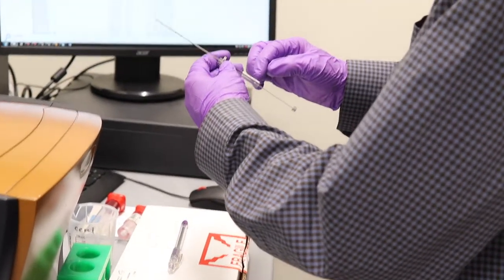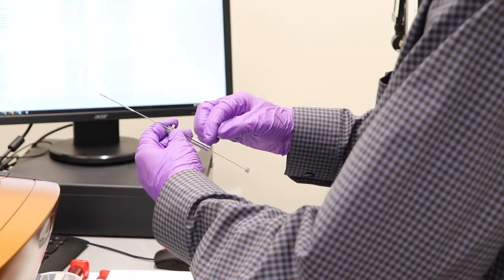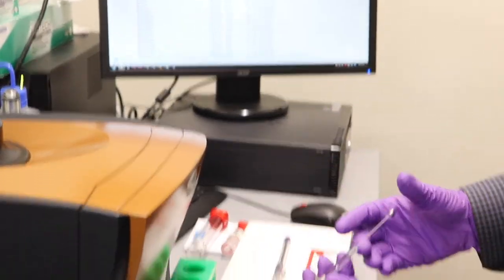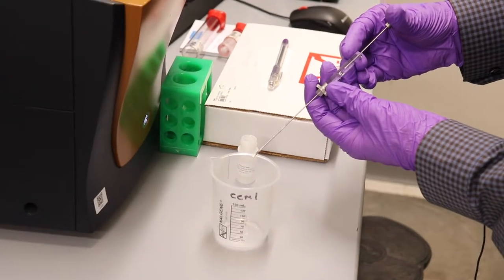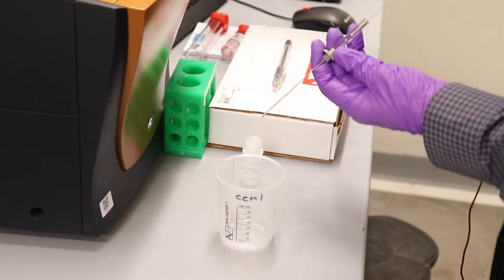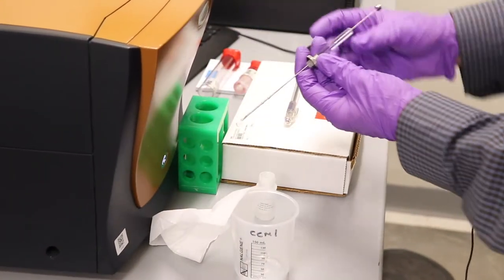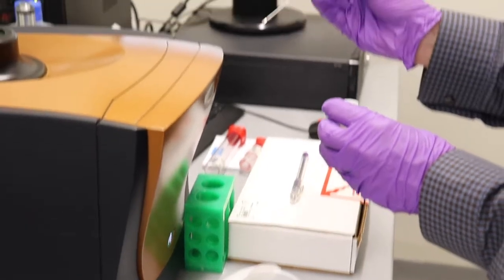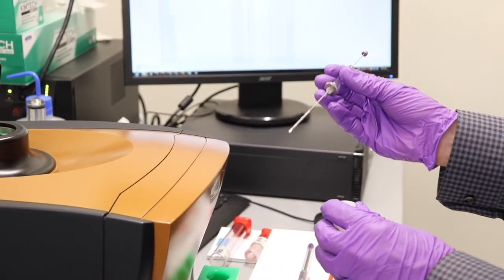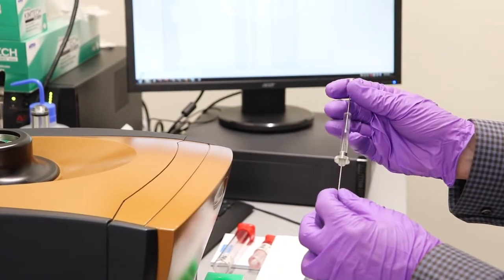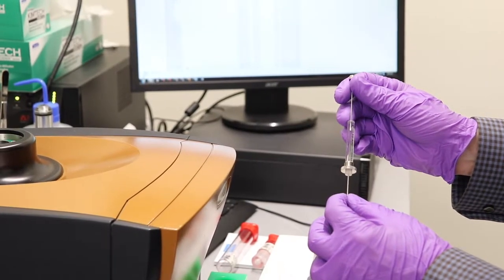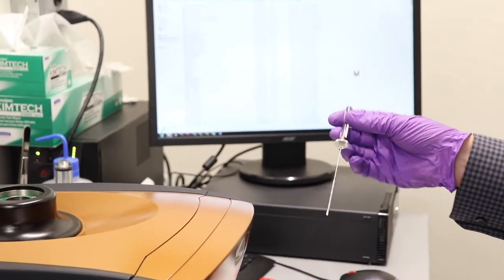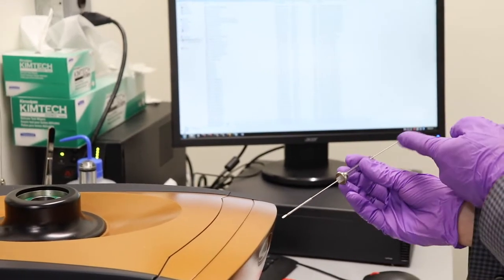Pull the plunger out and you can either tap it gently because it's glass or some people do a technique where you pull that quickly and the air bubble will come out. Okay. So now there's no air bubble at the base of the liquid here. So now I know I have liquid from here to somewhere in the needle. So what I'll do is gently push the syringe down until I have liquid coming out of the tip of it. And the tip is also the stir. So it's important to be very gentle with these because if the needle gets bent even slightly, it's going to give you a background when it's stirring that's very noticeable. And then you'll pull the liquid up to 52 microliters. So you'll be just off the gradation. So now I know I have liquid all the way from the tip up to 52.